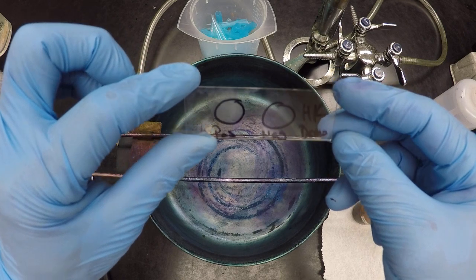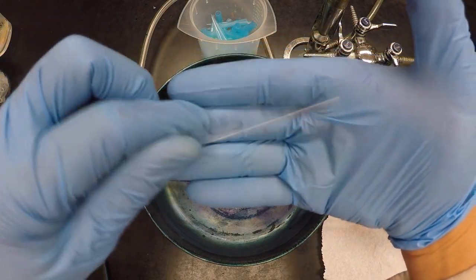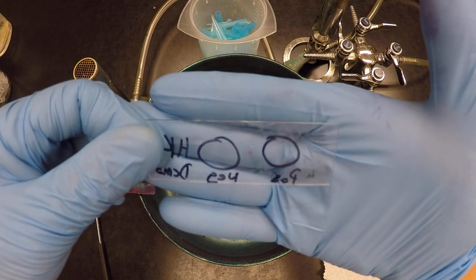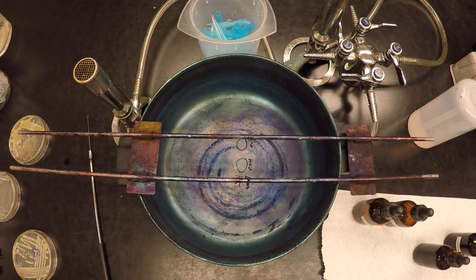So here's my slide, right? Remember, very important, put the samples on the back side. So here I have my two samples, my gram-positive demo, my gram-negative demo, both of which have been heat fixed and they're ready to stain. So place it on the staining rack like we always do.